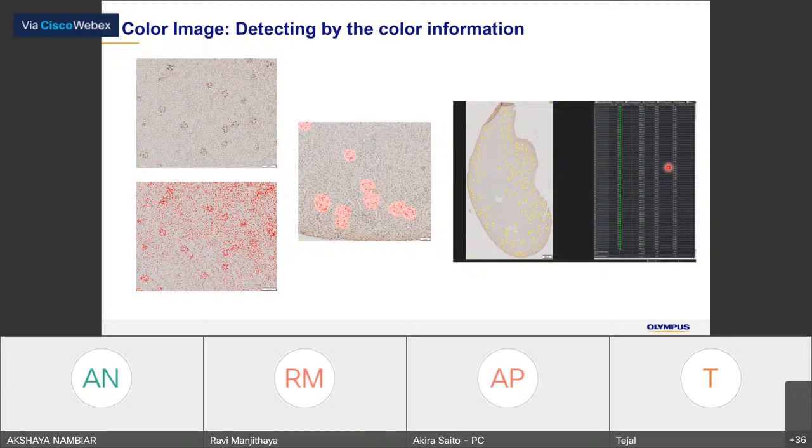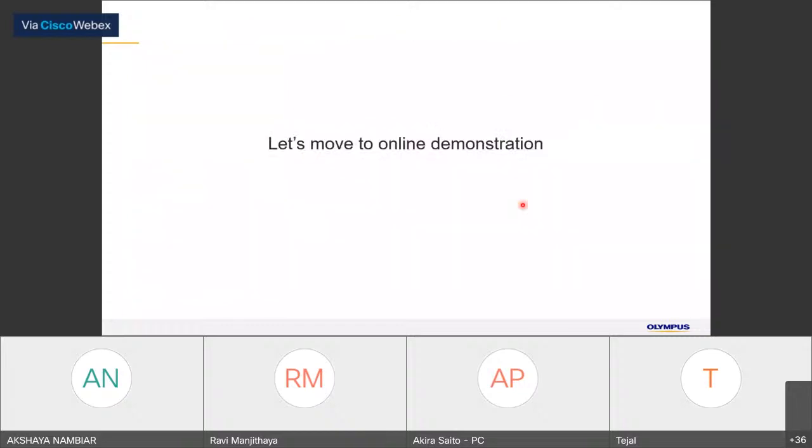This is just an example to identify glomeruli using this color image, and count in this section how many there are and how big they are. It is also possible using the neural network segmentation. So that is the last slide of my presentation.